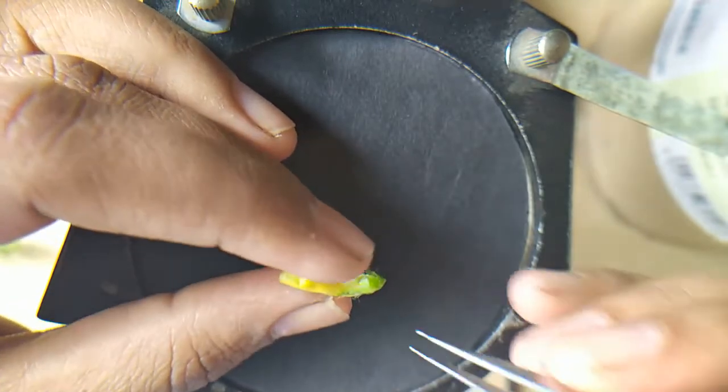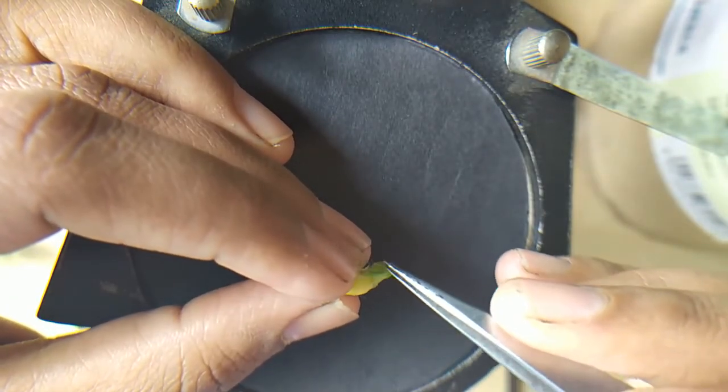Then with the help of forceps, remove it from both sides.